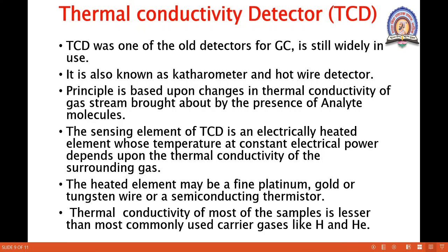The principle of this TCD is based upon the changes in thermal conductivity of the gas stream brought about by the presence of analyte molecules. The sensing element of this TCD is an electrically heated element whose temperature at constant electrical power depends upon the thermal conductivity of the surrounding gas.